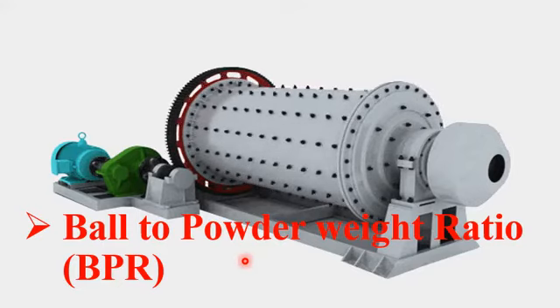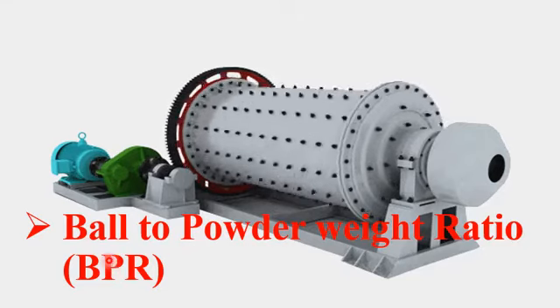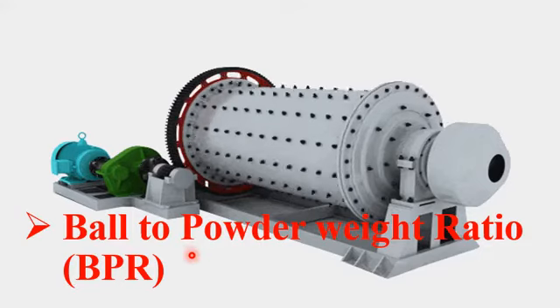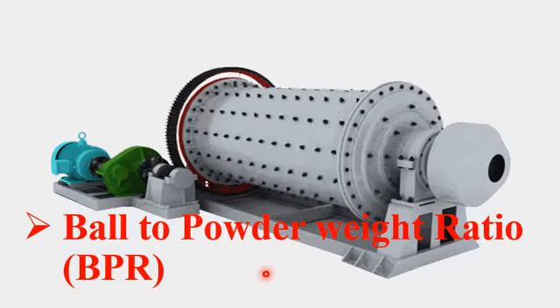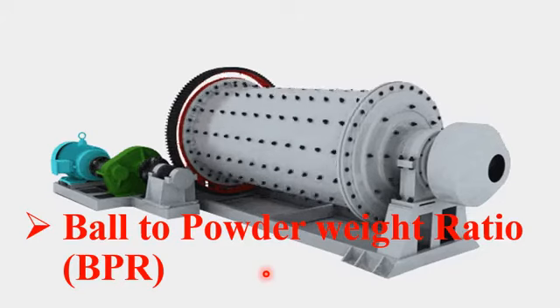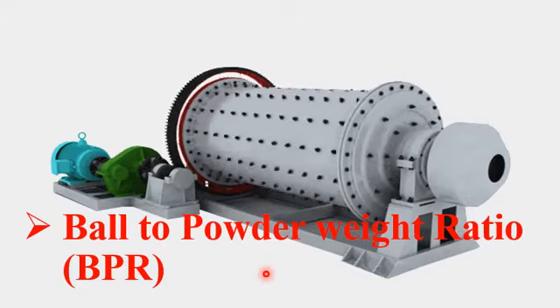So this is a very important key parameter in the ball milling process. Ball to powder ratio is very important in the context of getting very fine particles, nanoparticles, with a higher capacity and a device operating with better efficiency.